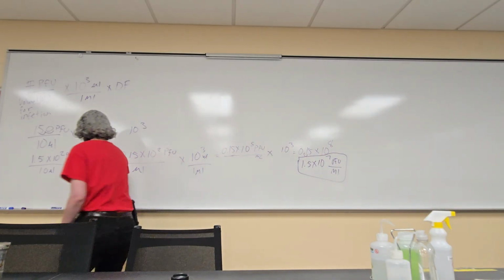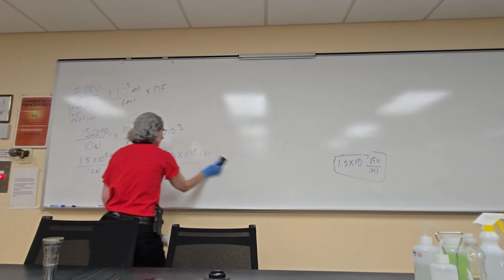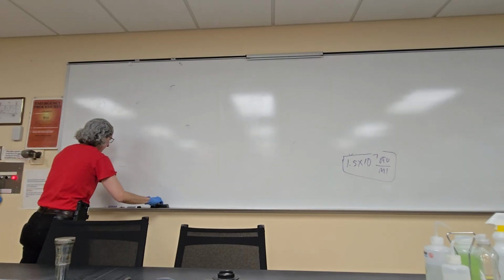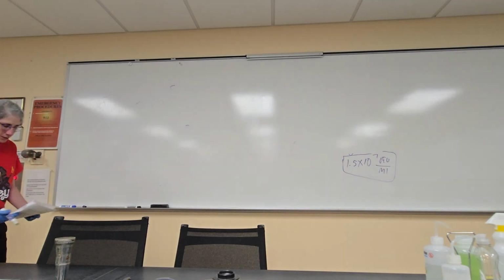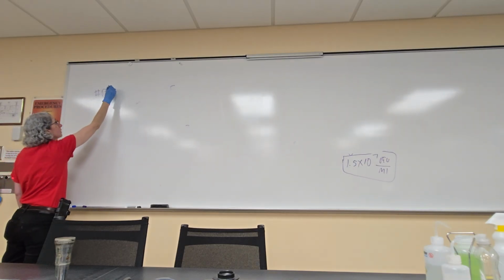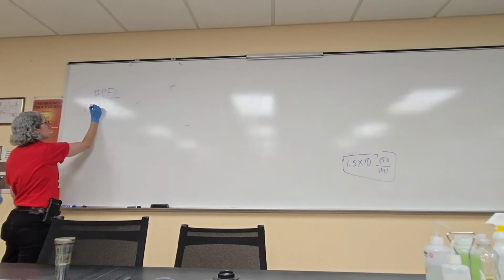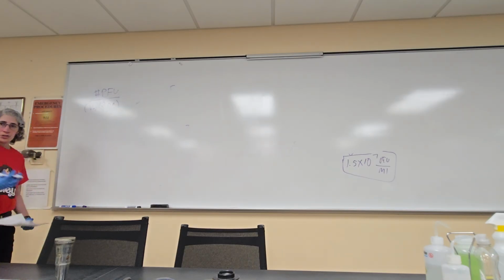So the other formula that you can do is, again, number of plaque forming units, but we're going to divide it by the volume, and the volume is already going to be converted into mils. And then multiply by your dilution factor, okay? And we should come up with the same answer.